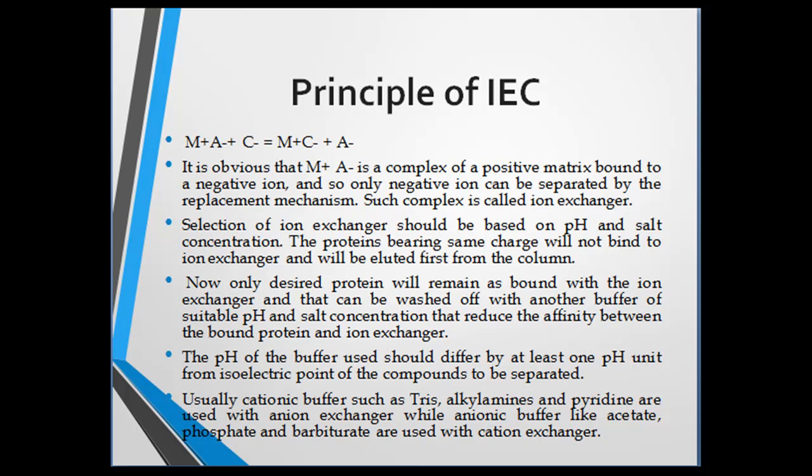Different proteins bind with the ion exchanger with different affinities. The passage of a particular protein down through the chromatographic column is retarded due to interaction between the protein molecules and the ion exchanger. The retardation is comparable to the rate of passage of solvent. The washing of a column is called elution, and by elution, proteins with low binding affinity for the ion exchanger will move down the column. Now we'll discuss different types of ion exchange chromatography.